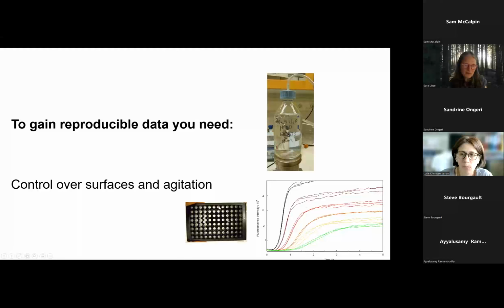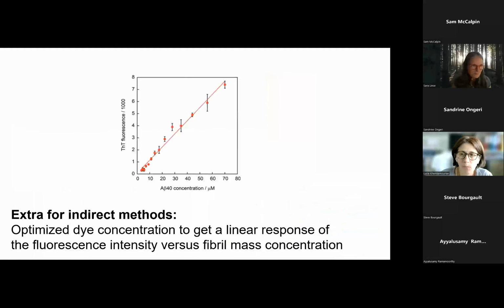binding of the peptide. So if you have plain polystyrene, you can have both catalysis and retardation of your kinetics, and it will depend on the concentration of the peptide whether you get retardation or catalysis. So if you take care of all these things, whatever the method, you will have nice reproducibility for samples of 10 to the 14 molecules or more. And these are triplicates, an example of triplicates at 6 different concentrations.